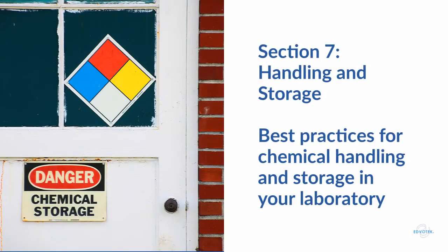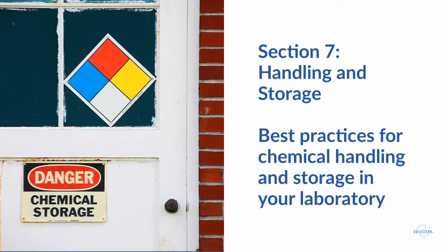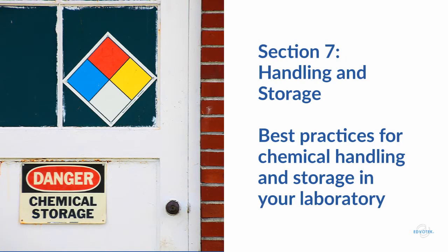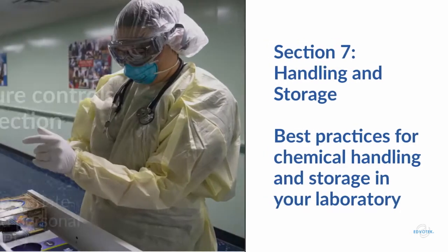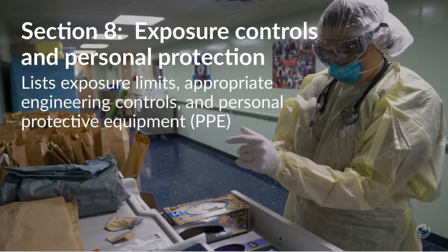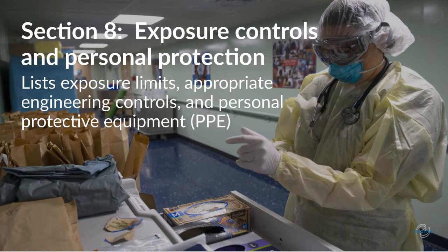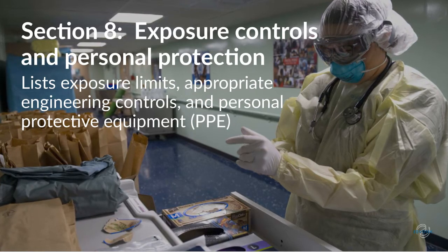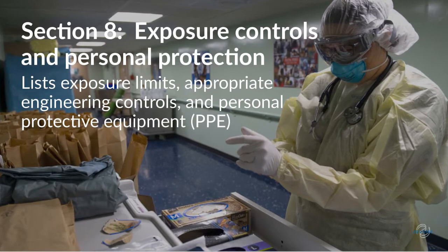After receiving your chemicals, you'll need to know how to store them. Section 7, Handling and Storage, describes safe handling and storage, including incompatibilities with other chemicals. Section 8 describes exposure limits, threshold limit values, and any other exposure limits used or recommended by the manufacturer preparing the SDS. This section also includes appropriate engineering controls and PPE.